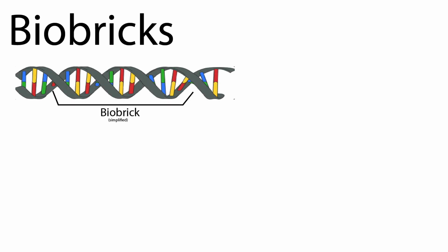In this video, we'll be covering the 3-antibiotic or 3A assembly method. Before we start covering the 3A assembly method, it's important to refresh your memory on biobricks. Biobricks are DNA parts that carry out a defined function.